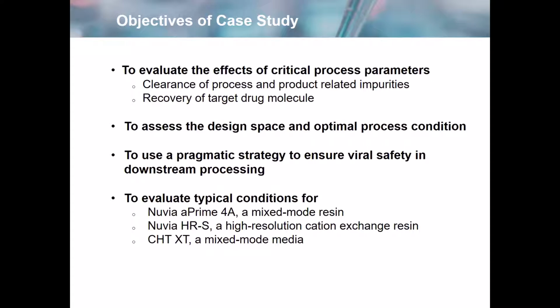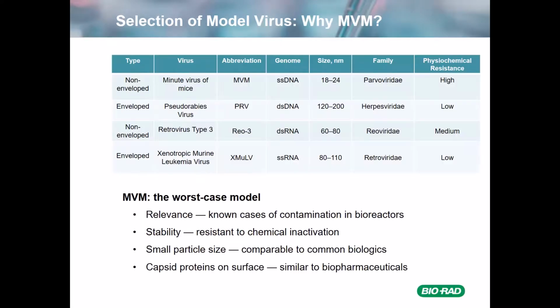Nuvia aPrime 4A, which is a mixed mode resin that is anion exchange and hydrophobic interaction. Nuvia HRS, which is a high resolution cation exchanger. And CHT-XT, which is also a mixed mode, but this mixed mode is calcium affinity and cation exchange.